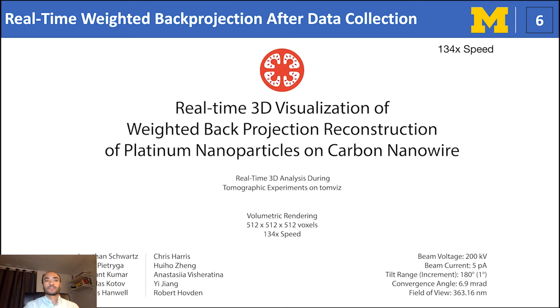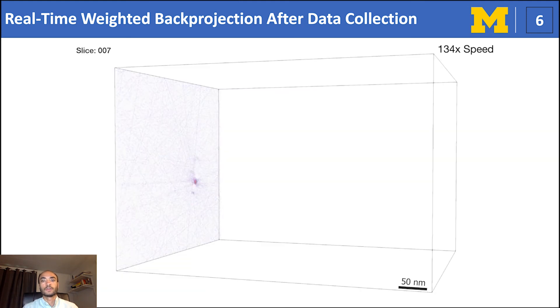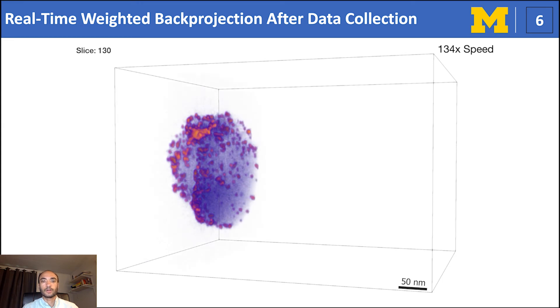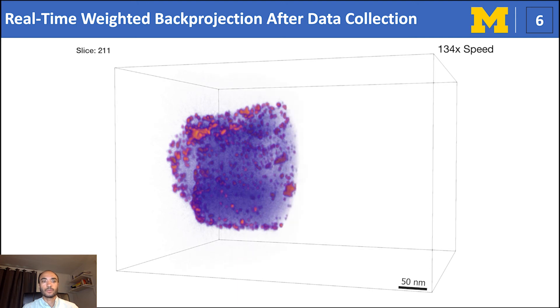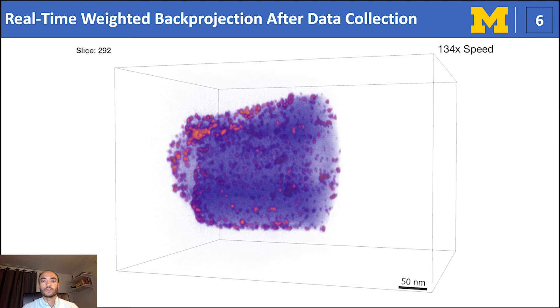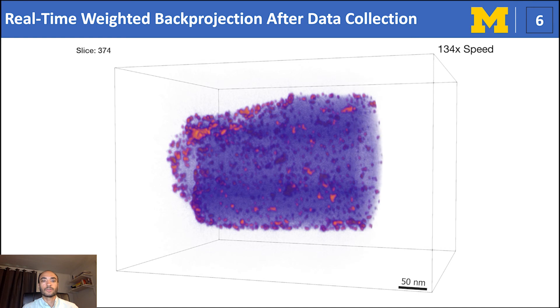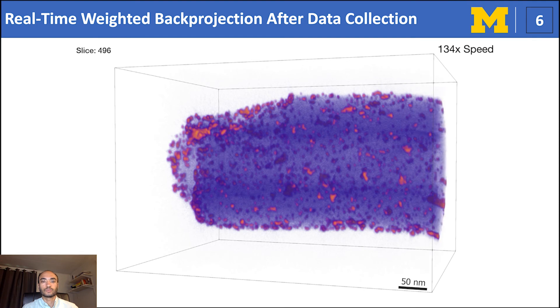The real-time visualization capabilities on TomViz is not merely limited to online applications, but is actually a viable tool to assess quality offline. On TomViz, we can display live volumetric updates for non-iterative algorithms as they occur slice-by-slice. Here, I'm demonstrating a weighted back projection of platinum nanoparticles on carbon nanowire. This video is sped up faster than the actual computation. These volumetric updates are provided along the direction parallel to the rotation axis, and we see more structure become visible as the reconstruction goes towards completion.